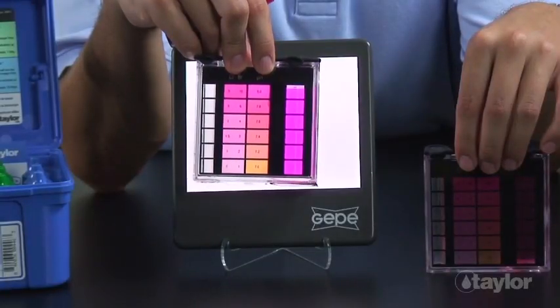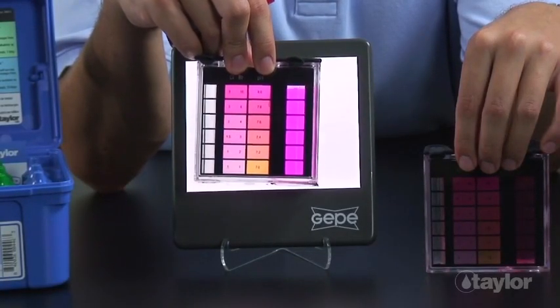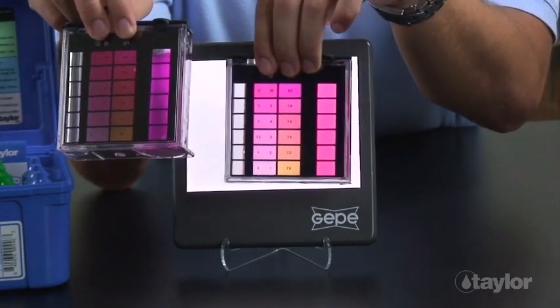If the bluish purple color develops, you must wait until the sanitizer level returns to its normal range before retesting the pH.